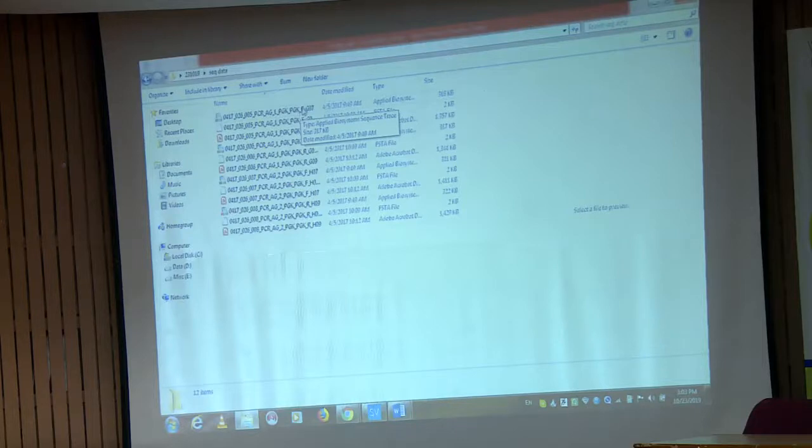There is one more software you can write down, there are plenty, but you can write down one, Finch TV software, Finch TV. That software will help you to view these chromatogram files. There is another software, DNA Baser. So, what will happen, this will be your chromatogram file.